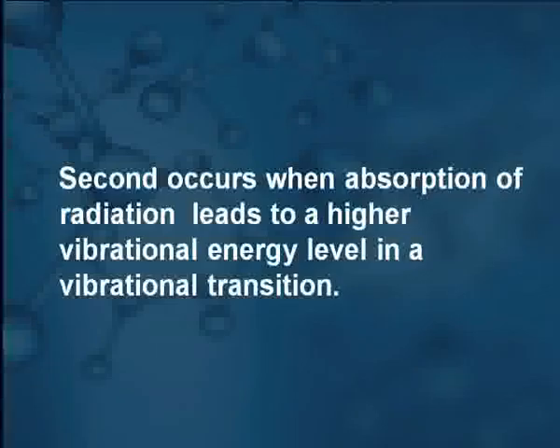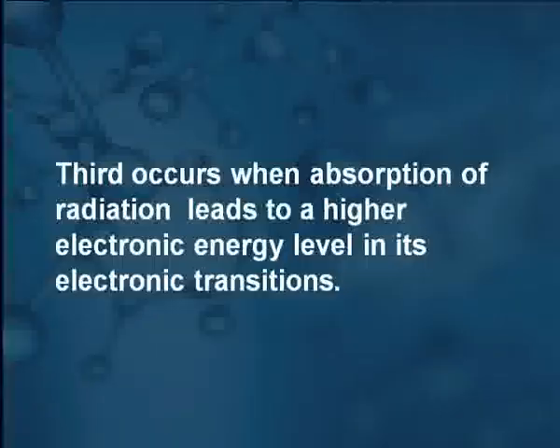The second occurs when the absorption of radiation leads to a higher vibrational energy level in the vibrational transition. Next, the third occurs when absorption of radiation leads to a higher energy level in its electronic transitions.